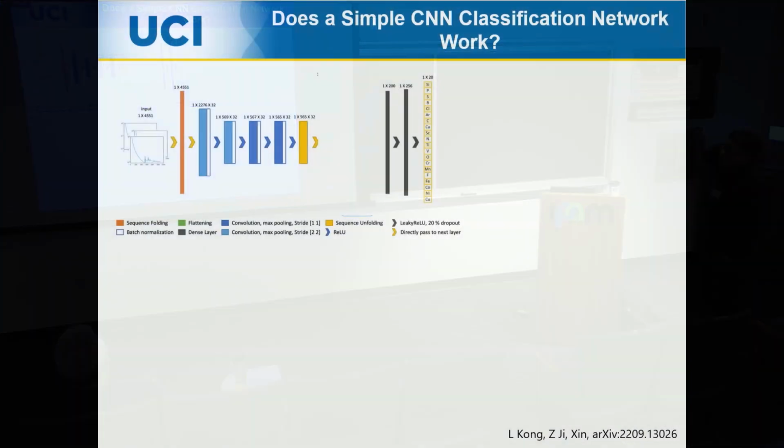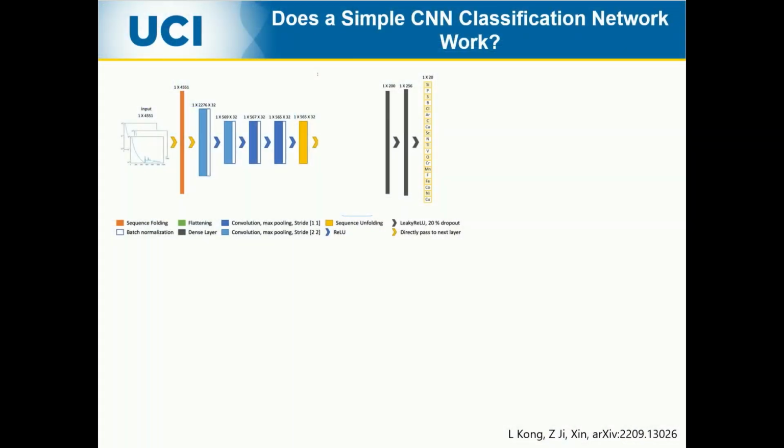So would a simple convolutional neural net classification network work here? This is a spectral problem. We want to know where the edges are, and the answer should be no. It wouldn't, because this simple network only tells you that you have a dog and a cat in your images. It's insensitive to where the dog and cat are. So we all know that if you want to know where they are, you need to piggyback another localization network component onto this.